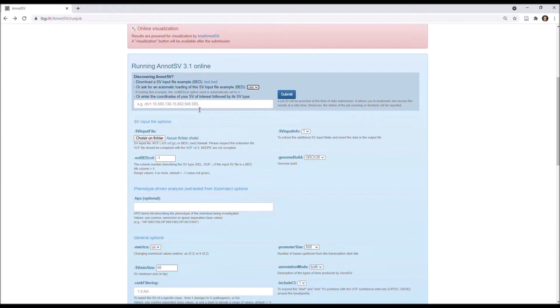Else, you can also choose to submit a single SV. In this case, you need to enter the coordinates of your SV of interest, followed by its SV type.